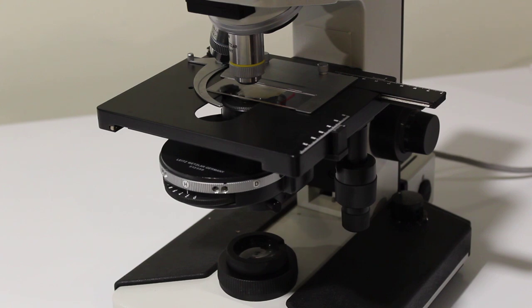In this episode I'm going to talk about the optical components of your microscope, how to understand what they do, and how to determine the kind of optics your microscope must have in order to meet your needs as a brewer.